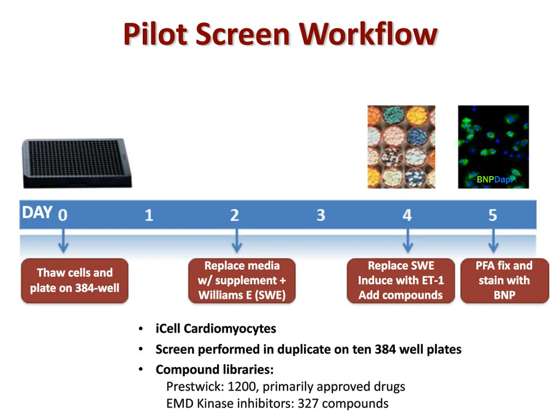So the screen was performed in duplicate on 10 384-well plates. The compound libraries that were screened were the Prestwick library, which consists of 1,200 compounds, primarily approved drugs, and the EMD kinase inhibitor library of about 327 compounds.